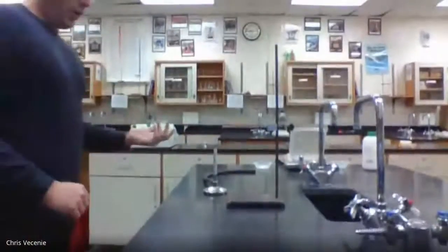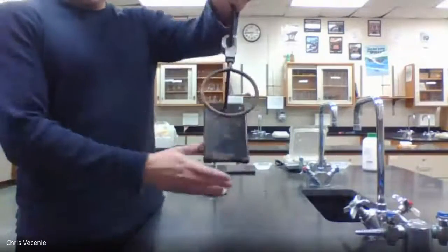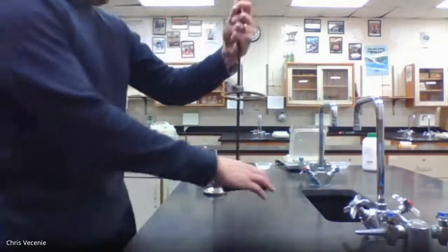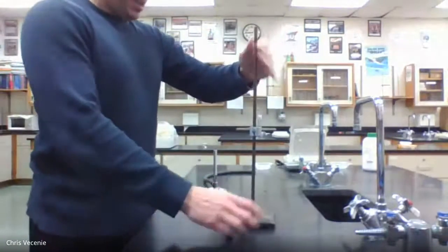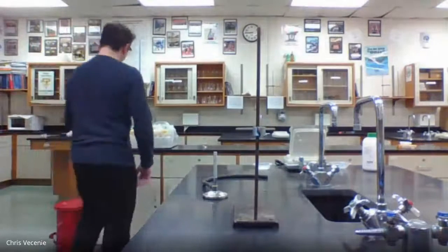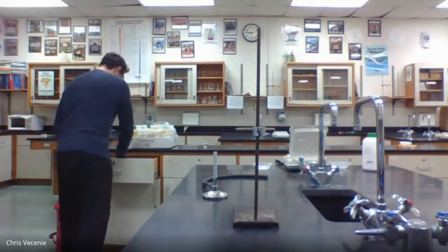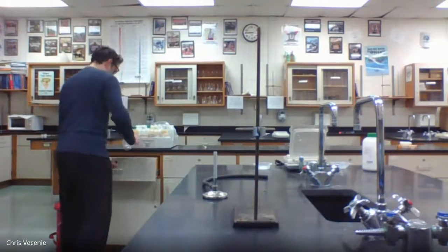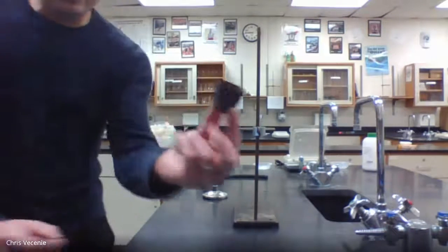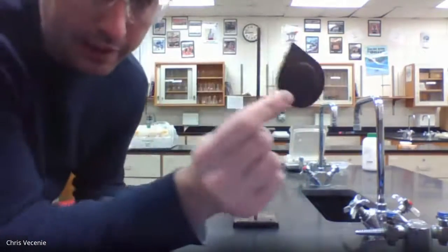All right, and first thing I would do is I'm going to take down my ring stand with my iron ring on it. We're going to be using this for heating. Okay. Get out my Bunsen burner. Go over here. Get myself a crucible and my lid.